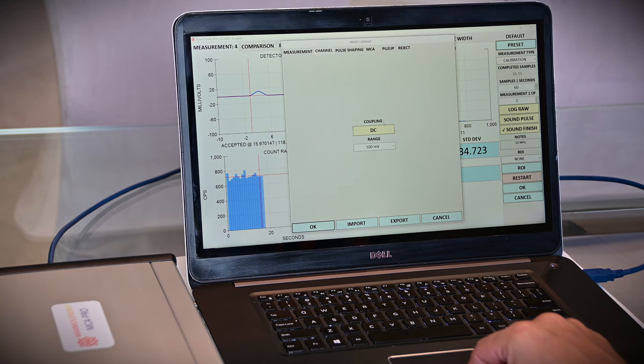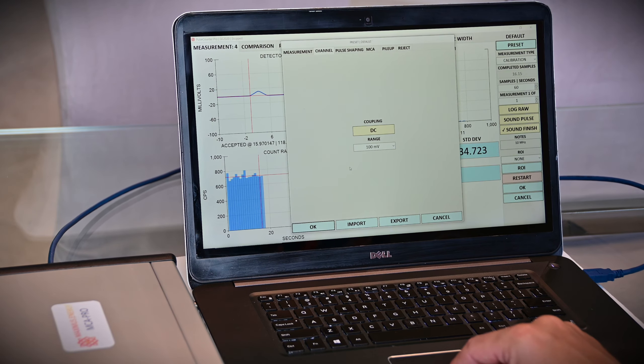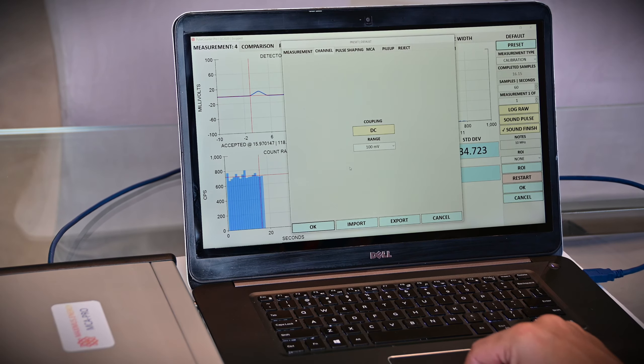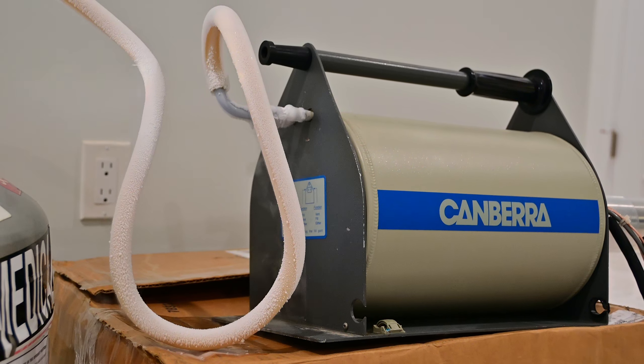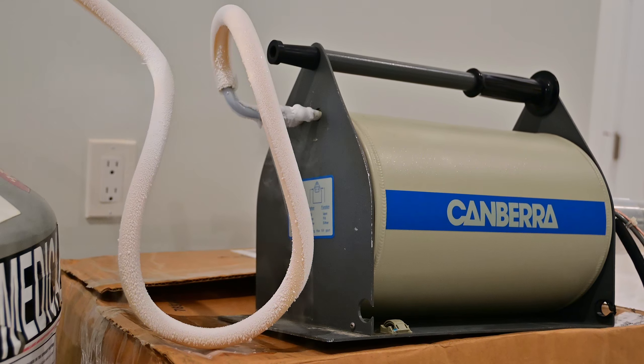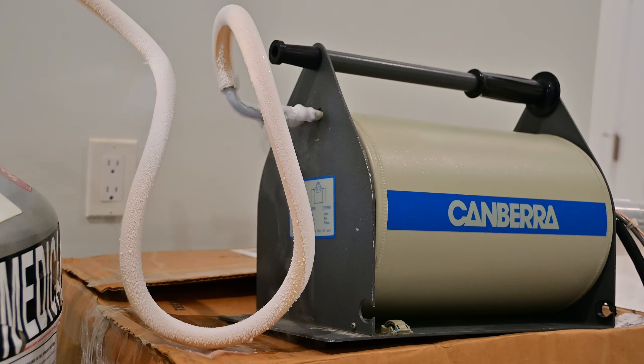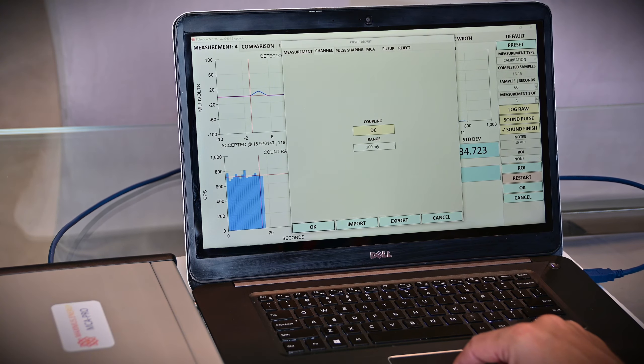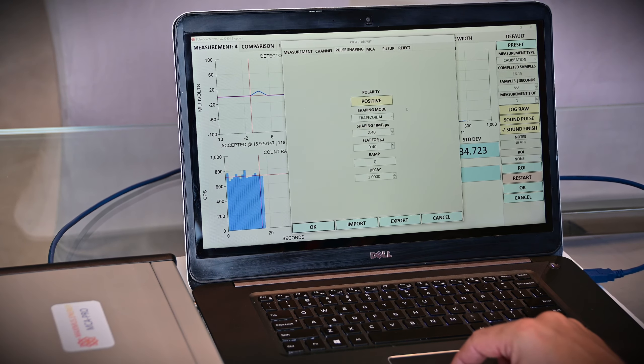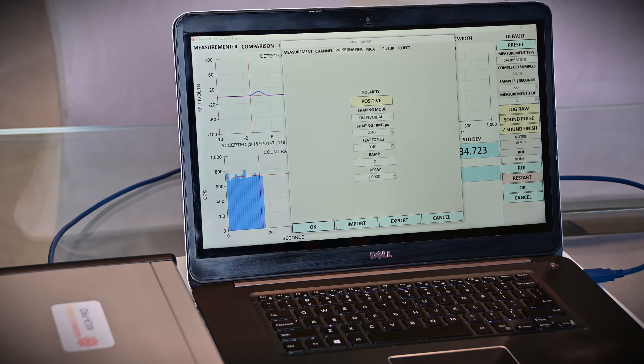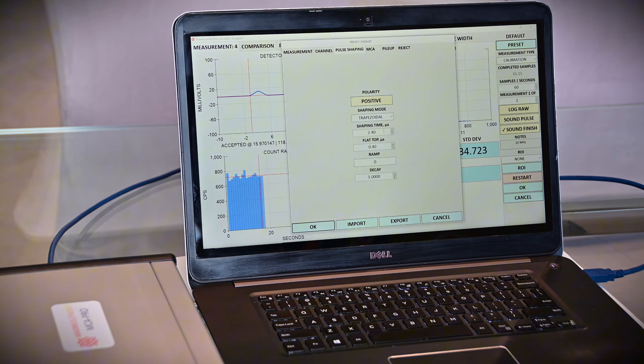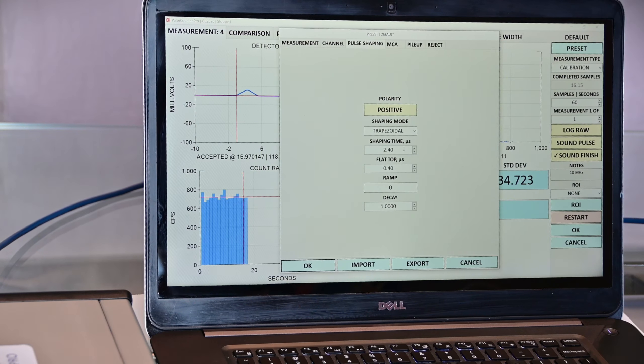The recommended coupling is DC, and the recommended voltage range depends on your detector. It's 100 millivolts in my case, and I'm using Canberra GC2020 detector. The pulse shaping needs to be trapezoidal, and positive or negative polarity depends on your detector type. Shaping time on the order of 2 microseconds, and flat top is on the order of half a microsecond.